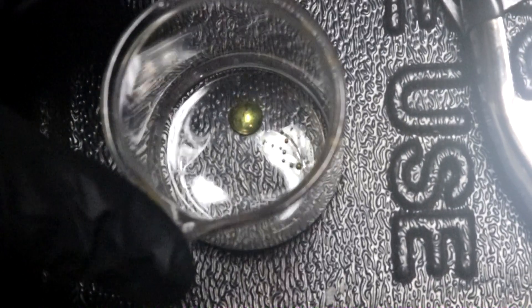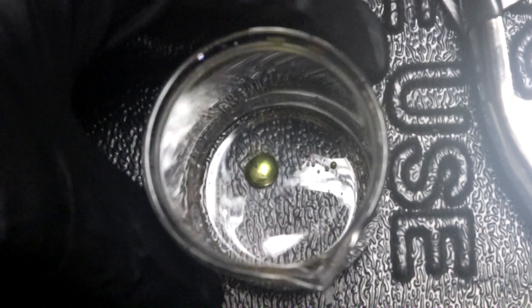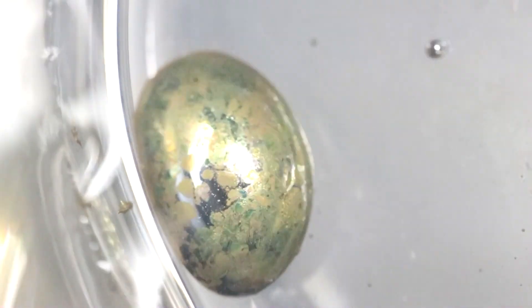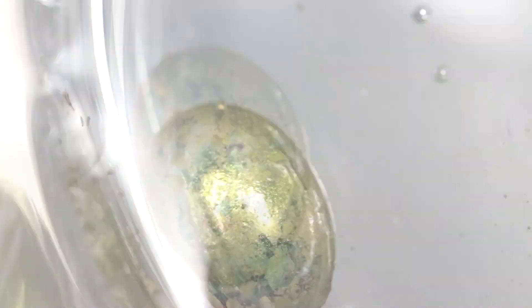It's been about 24 hours and the objects are still right where I left them. Something really interesting: in this beaker, the mercury I squeezed out of the copper — I put water on top to keep it from evaporating — has changed color. Bringing it up close, you can see it's gained a gold tint to the surface of the mercury. I just thought that was interesting.